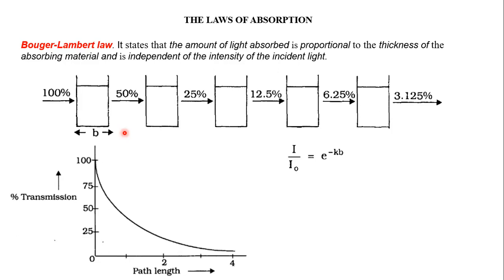So imagine that in front of you, you have a gelatin sheet placed in between a source of light and you. There is a single gelatin sheet. Say suppose it is red in color. So whatever comes to you will be red in color. You will see red light coming out.